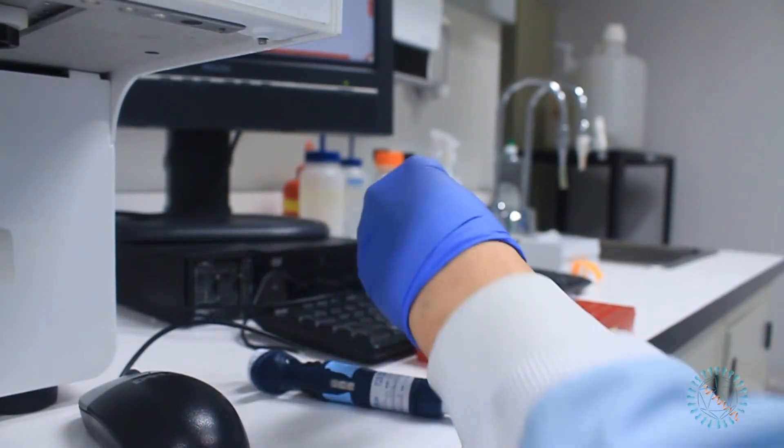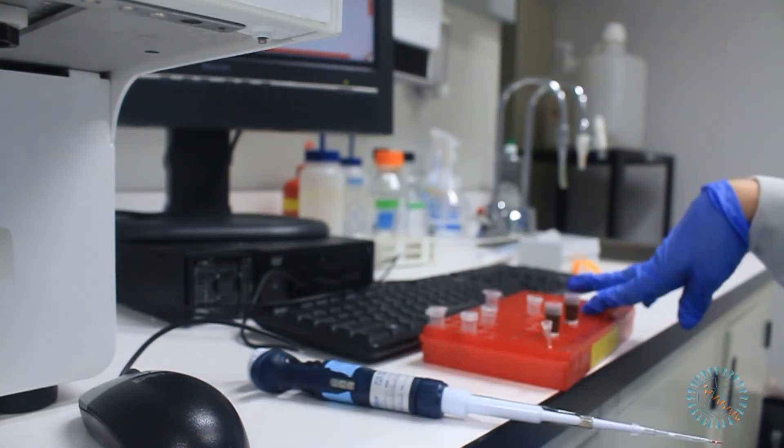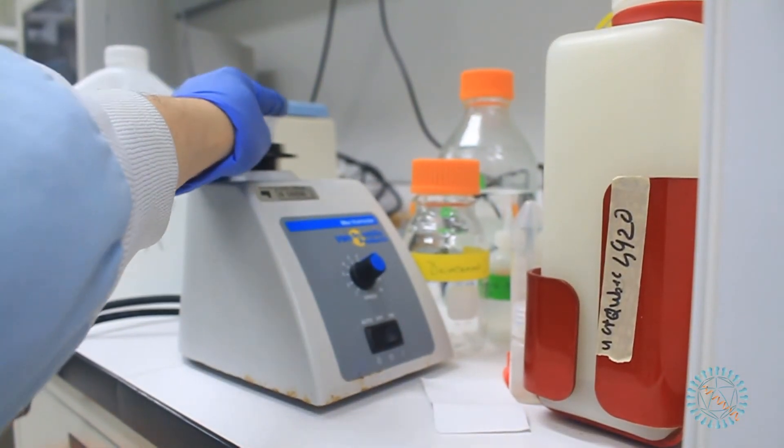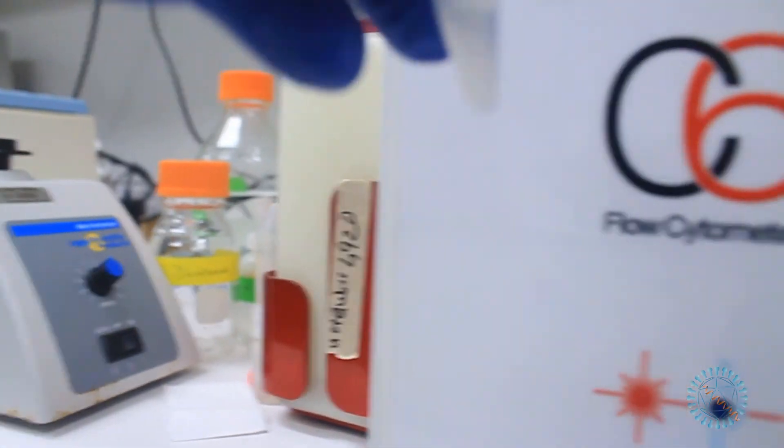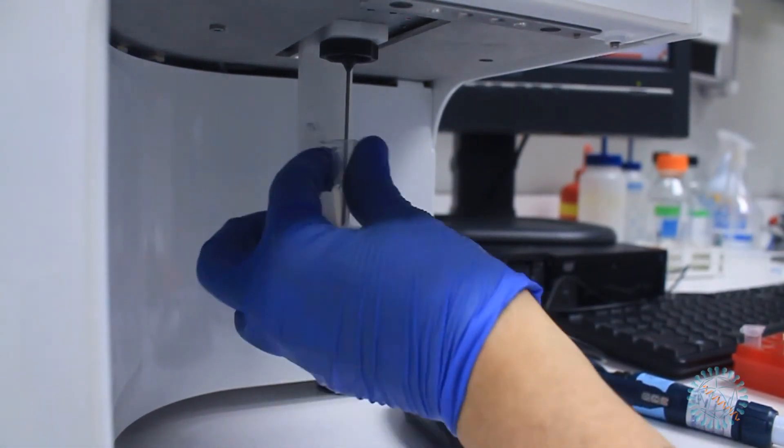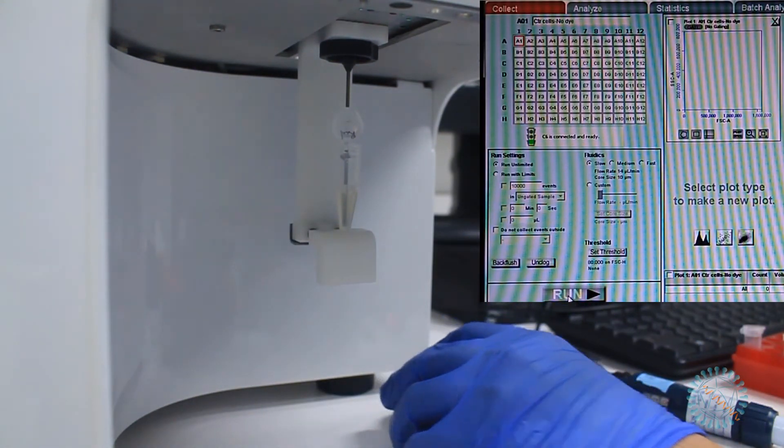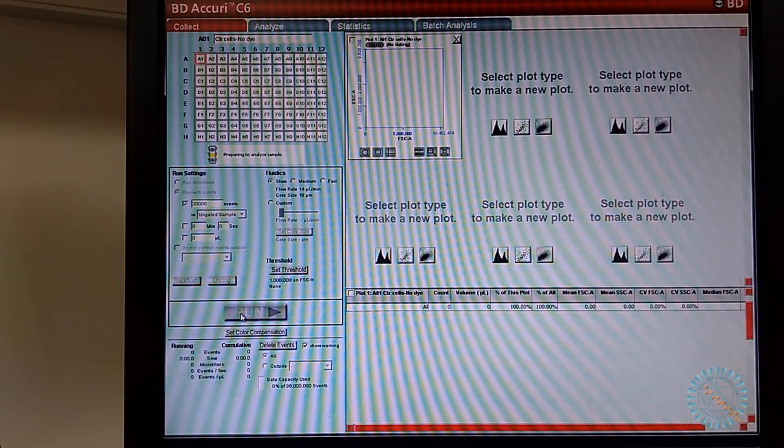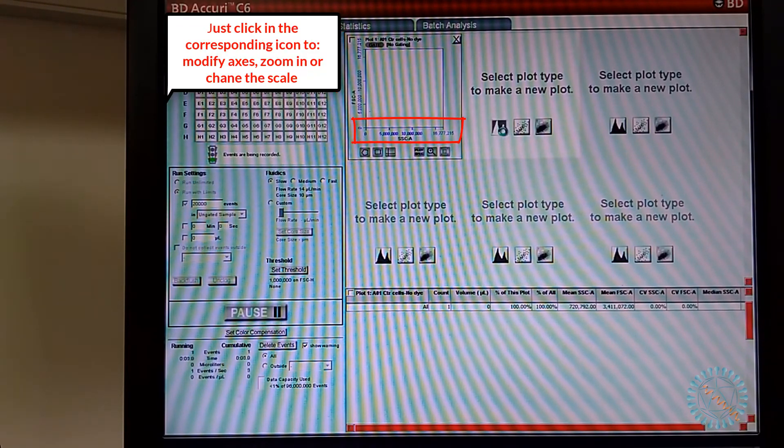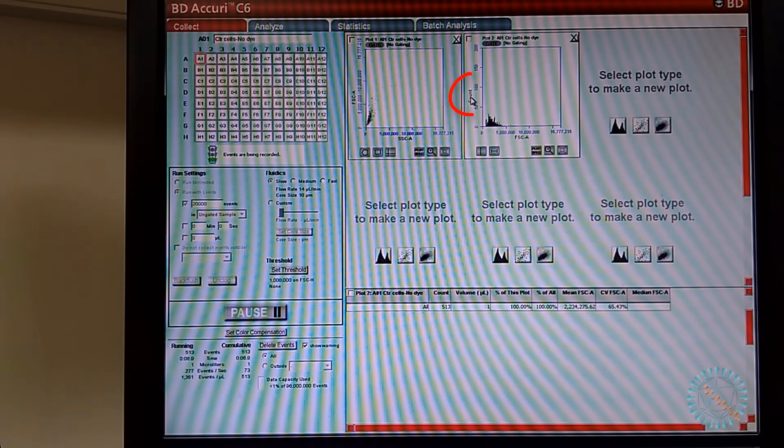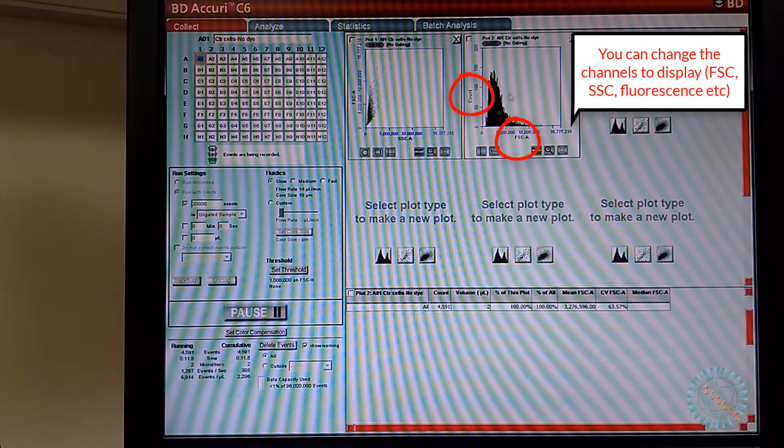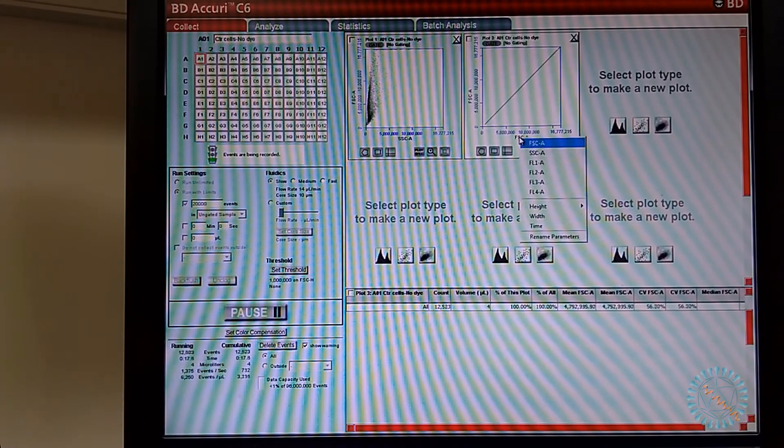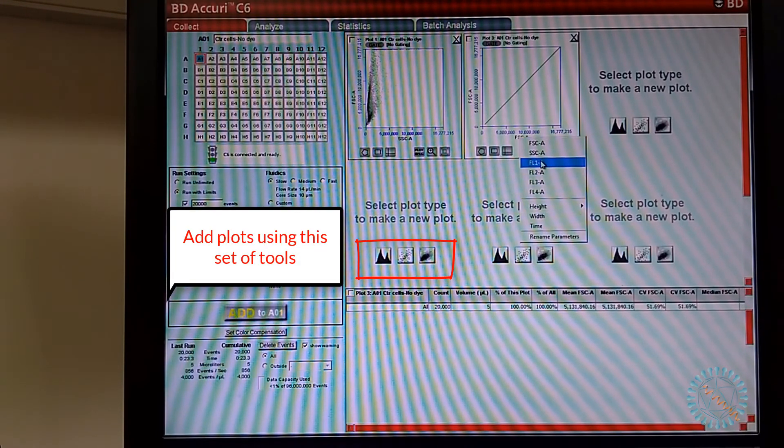Collecting data with the Accuri C6 is very simple. We just take the sample and resuspend the cells by scraping the tube on the rack. We homogenize the sample by quickly vortexing and then we can place the tube on the sample injection port. A simple click on the run button will start the pump and the cells will begin to flow through the instrument. The software itself is very easy to use. While data is being collected, you can modify the axis to show different parameters, modify the scale, or zoom in and out of the data set. You can also create new plots to show the information that is being collected in different channels. Depending on the sample you are running at the time, you may want to incorporate different graphs to the workspace.